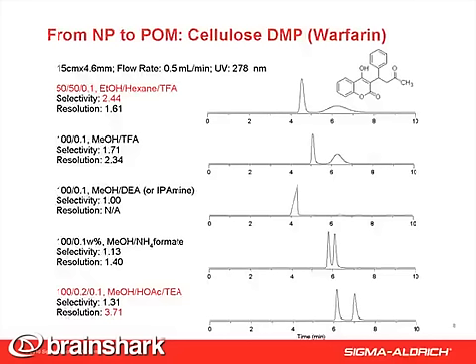The story begins with chiral warfarin separation going from normal phase to polar organic phase using different types of additives. The first, normal phase, shows the best selectivity, but peak two is very broad. I switched to 100% methanol with TFA additive — the result is better, but not good enough. The third, when using DEA to replace TFA, there is no retention or selectivity at all. Then I switched to ammonium formate, which shows almost baseline separation. And then switching to typical polar ionic mode for the chiral biotic with the acid-base at a 2-to-1 ratio gives the best result of all five cases.